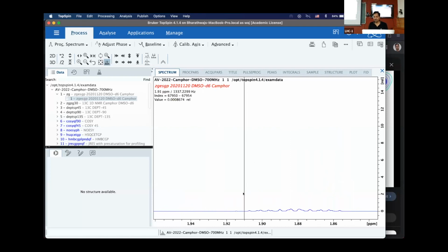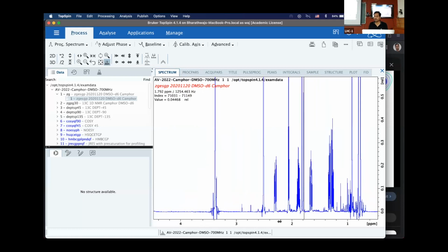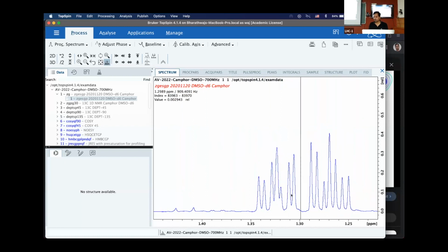For instance, let's assume this is 1 proton. Are you guys able to see how much space it occupies? And it has too much information hidden inside it, right? Same example here as well. If you slowly pay attention, do you see mirror images of each other? There is one here, there is one here. So basically, it's a doublet that got split into further fine structure splitting. Okay, so that's what is happening here.